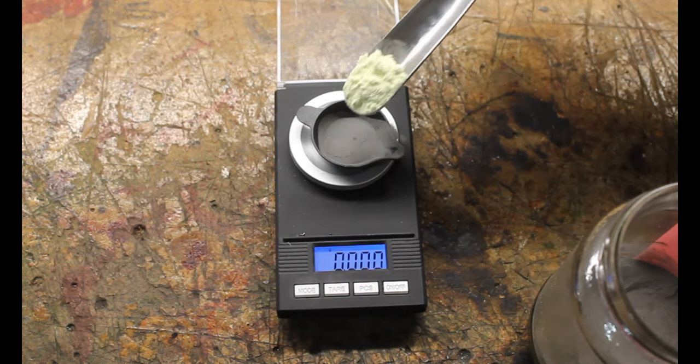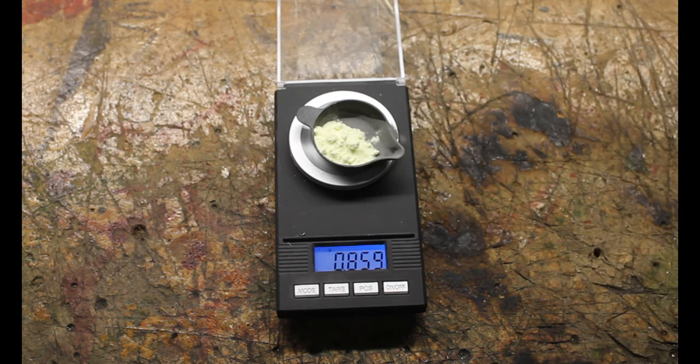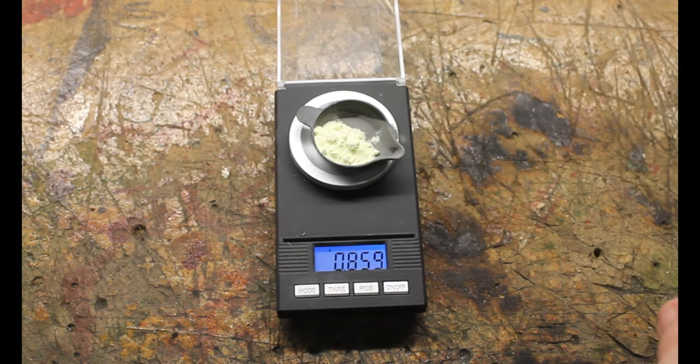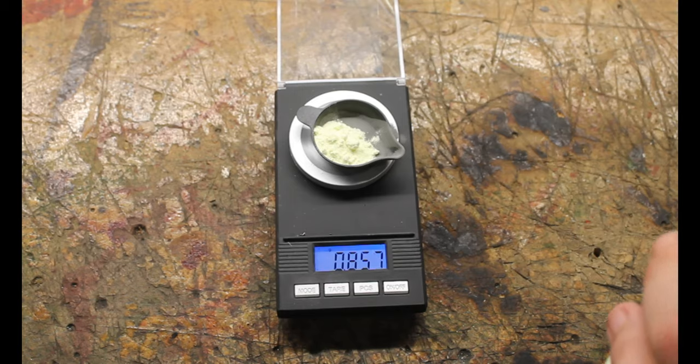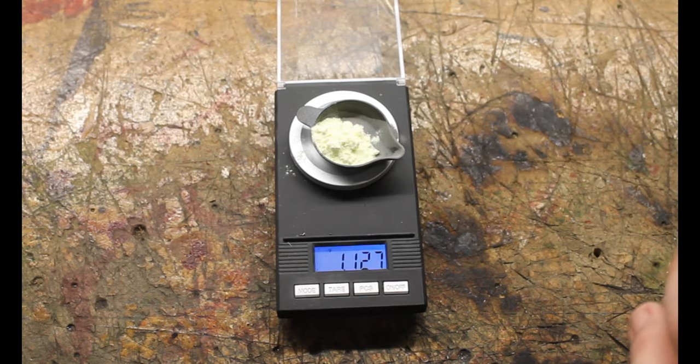We are then going to measure out 5 grams of sulfur powder. Now due to sulfur being so much less dense than iron, this is once again having to be done in two separate measurements, each of about 2.5 grams.